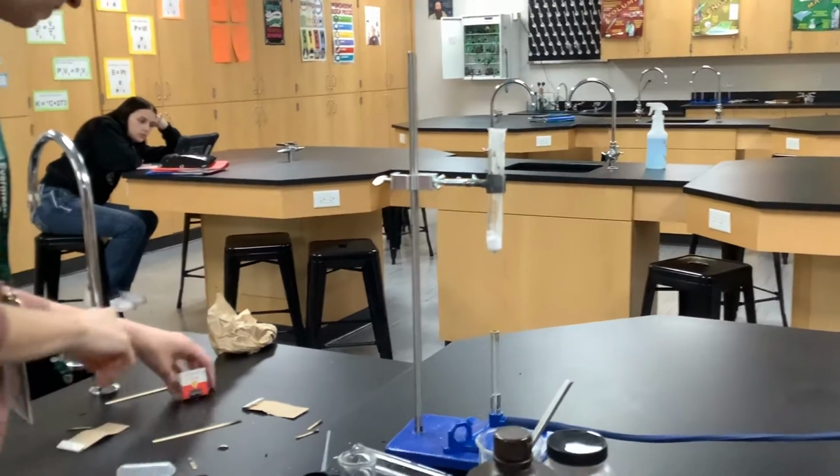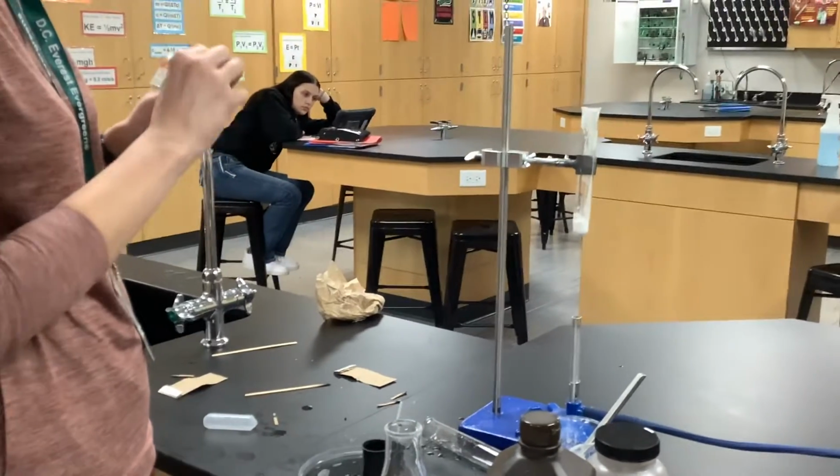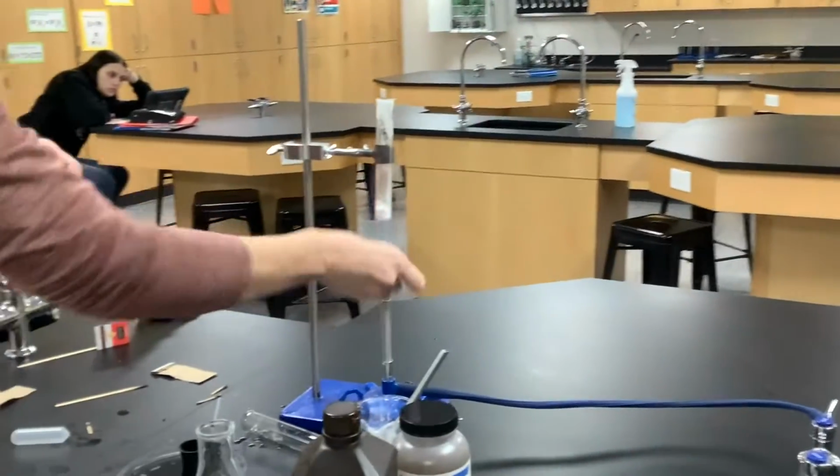So we'll do that like this. Oops. Right there.